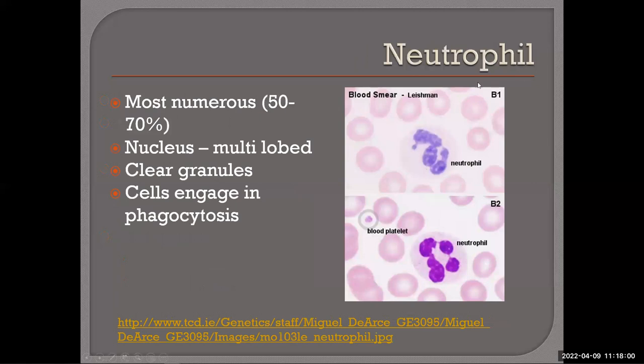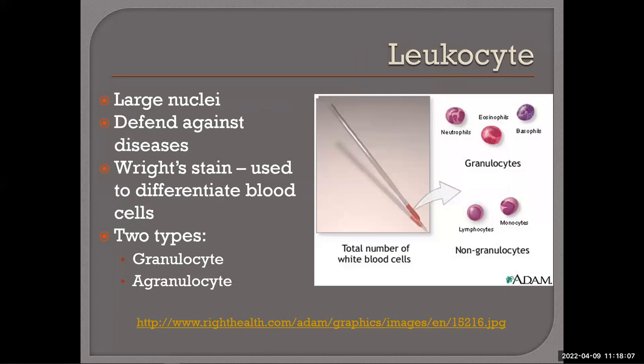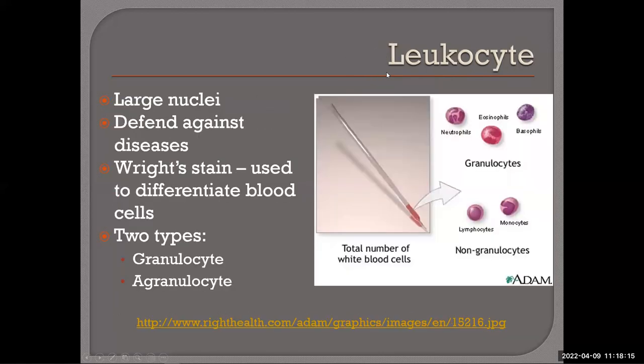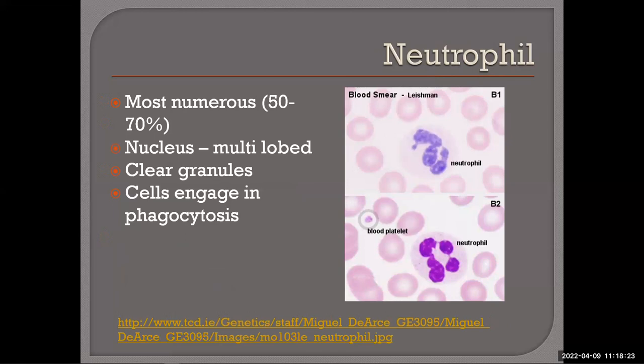Okay, so neutrophil, granulocyte or agranulocyte? Which one is it? Granulocyte. Right, granulocyte, because B-E-N, right? Granulocytes have the grains, agranulocytes or non-granulocytes, those are without. So neutrophil, so here we see it has the grains in it and it is multi-lobed, note the structure, right? Clear? It has multi-lobes or multiple parts to it.